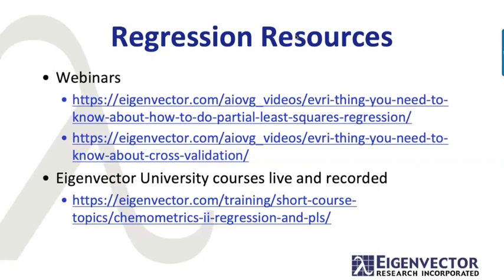Let me backtrack on that one that I answered no about PCR versus PLS. It really, PCR on average is as good as PLS. It's just a little harder to use because you often, well, really almost always have more factors in your PCR model because of the fact that they're determined without using Y information.